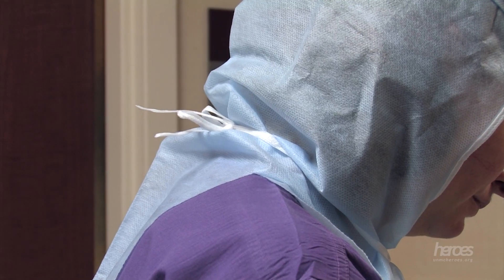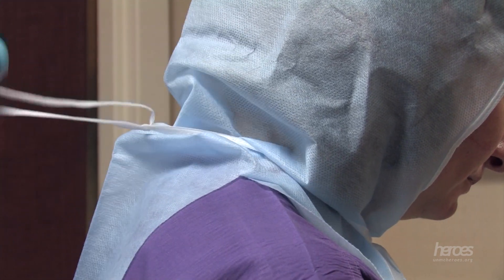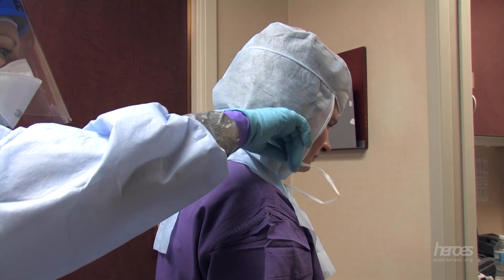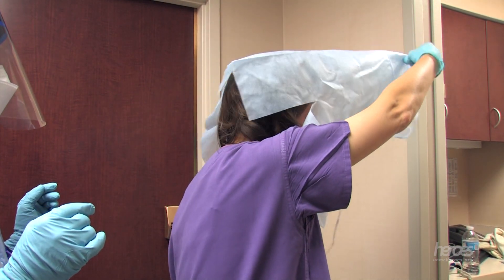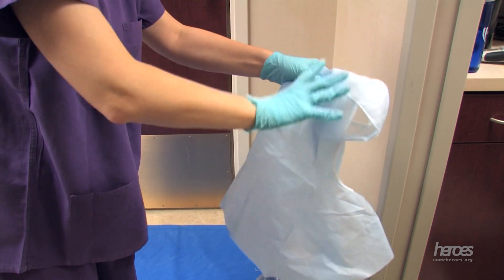The surgical cap should be untied by the doffing partner. Note that the surgical cap may shift with the respirator straps as they are removed. Remove the head cover or surgical cap with a gentle up-and-forward motion, touching as little of its contaminated surfaces as possible. Gently place the head cover in the trash.